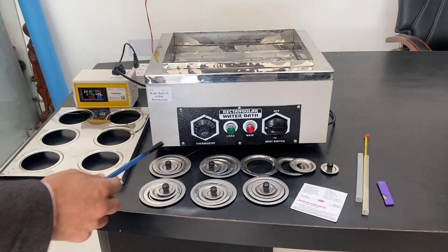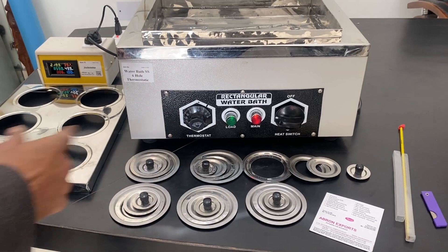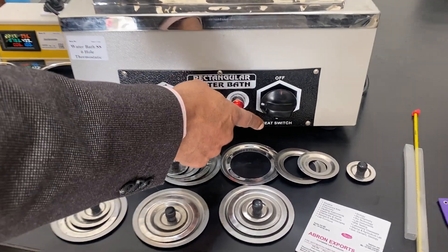This is a brown rectangular water bath which is thermostatic. The temperature is controlled by this knob and heating is controlled by this section.